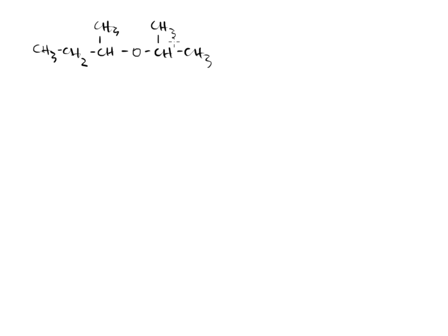Okay? So we said that this homolytic cleavage, and I'm going to write that up here in the top corner. This is the homo version. We'll look at alpha carbons. So this oxygen has an alpha carbon. It's right here. And it also has an alpha carbon to this side. It's right there. Again, those are carbons directly attached to the O. The same definition that we used for halides, the carbons attached to the chlorine or the carbons attached to the bromine. And the molecule can make the judgment to cleave at an alpha carbon.